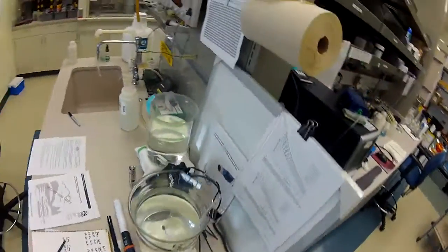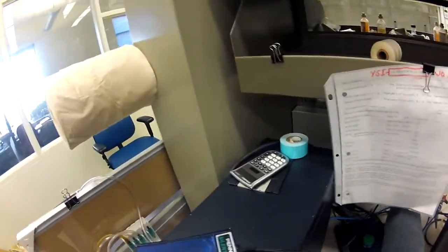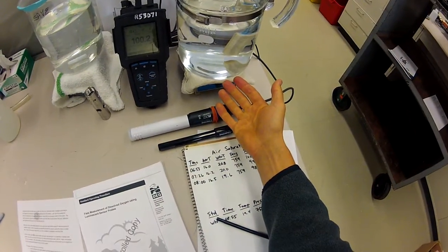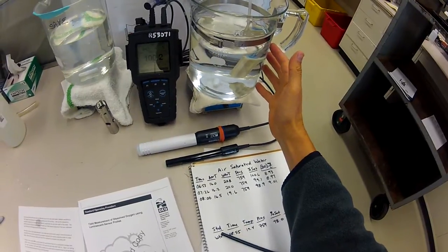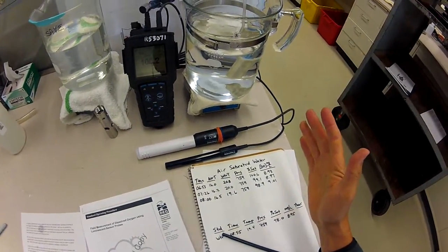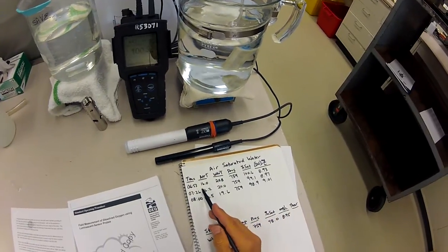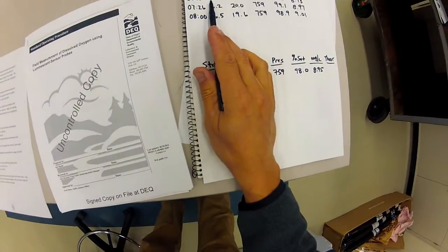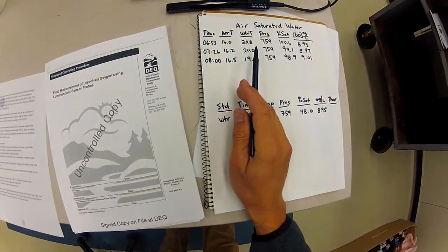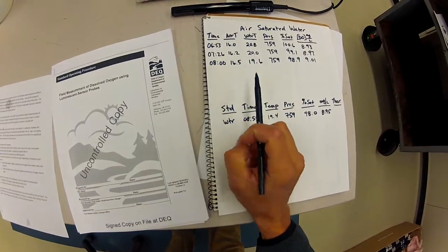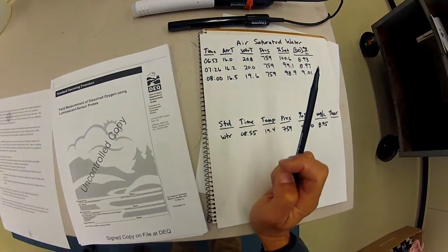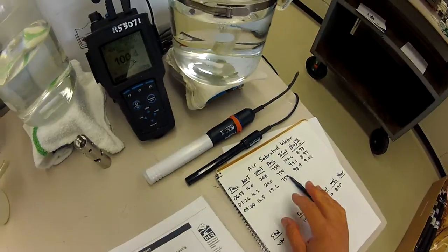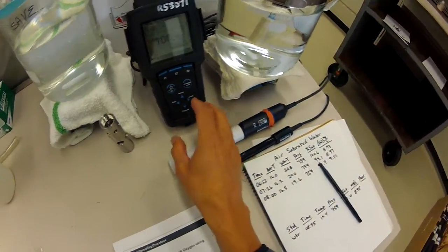If you need to be calibrating the meter while this is being set up, that's okay too. But especially as you're learning the process, I recommend documenting. After 30 minutes, turn off the air pump. I'm going to leave the stir bar going. We want this water to be within about 2 degrees centigrade of the air temperature. This morning here before 7 o'clock, it was a little cool in our laboratory, 16 degrees, and the water temperature was still at 20 degrees. It hadn't cooled down like the air had. So this is not ideal, but that's what happens when you're doing this stuff in the real world.